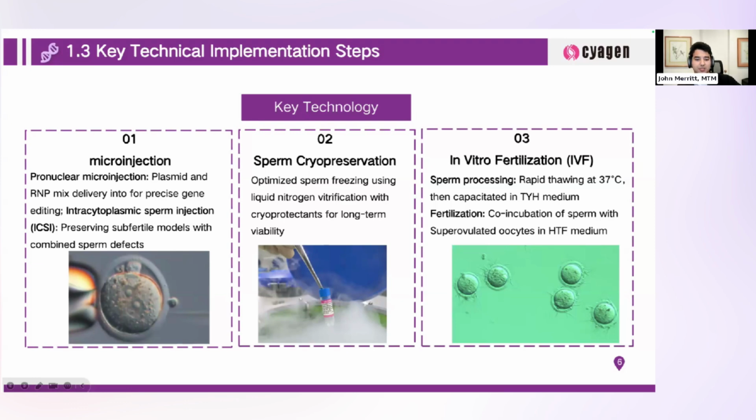While originally maybe nobody's interested, because we have like 16,000 of them and it's impossible to know exactly what people want before they want it, when someone does want it, we just pull out the sperm, do sperm recovery, and then generate mice immediately.